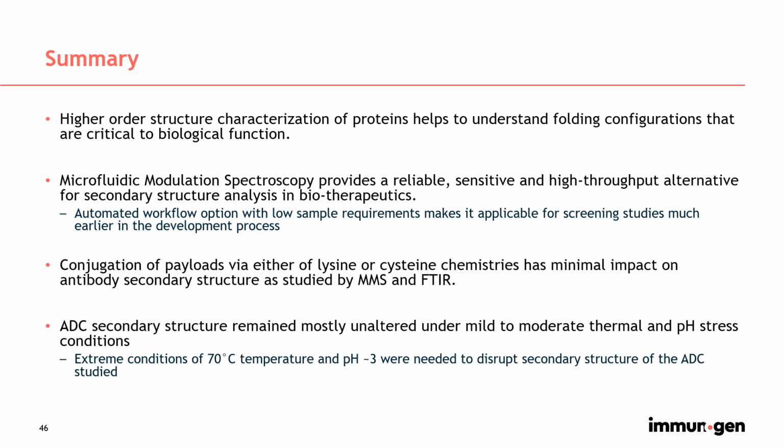So in summary, studying the higher order structure of proteins helps to understand the folding configurations that are important in its biological function. Also, MMS provides a reliable, sensitive, and higher throughput alternative for secondary structure assessment of biotherapeutics, with the automated workflow option being a major advantage.